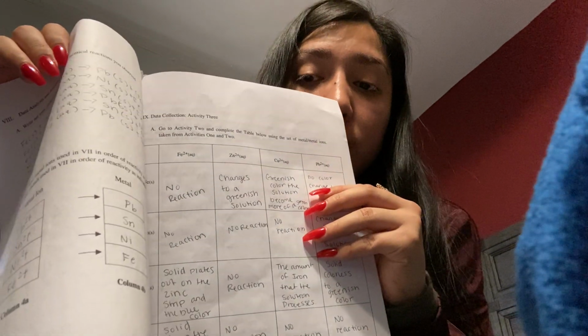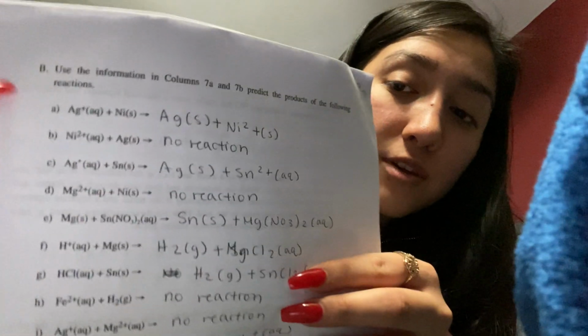And basically it was a repeat of the same thing, so we would continue doing it and make sure there was a color change as well, or no reaction, with a certain number of chemical equations that they made us use. And also rewriting whether there was a strong or weak equation on it. And then we continued on doing it, and later on they gave us a certain number of equations and we made sure that we could rewrite them all. And then yeah, that was the metal ions lab, and this is the final inquiry lab. And that's it. Thank you.